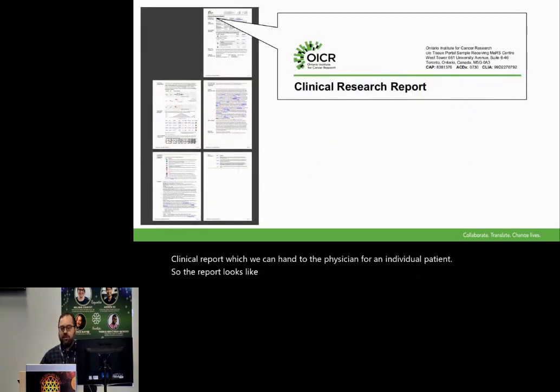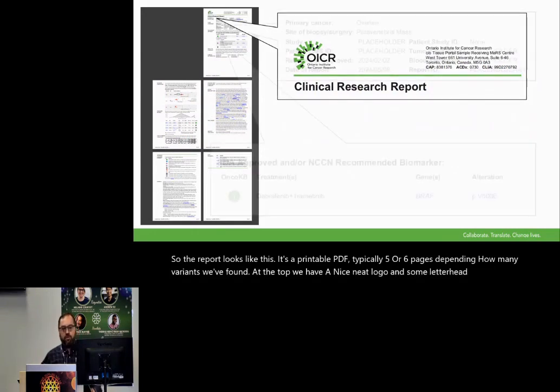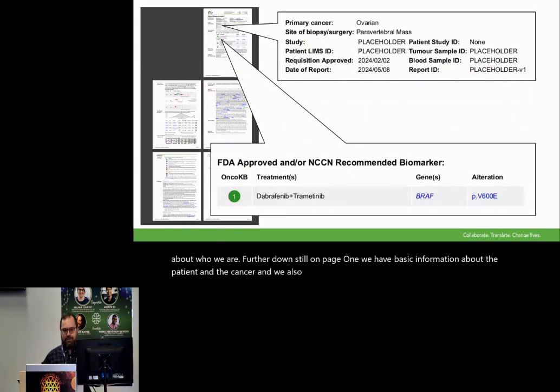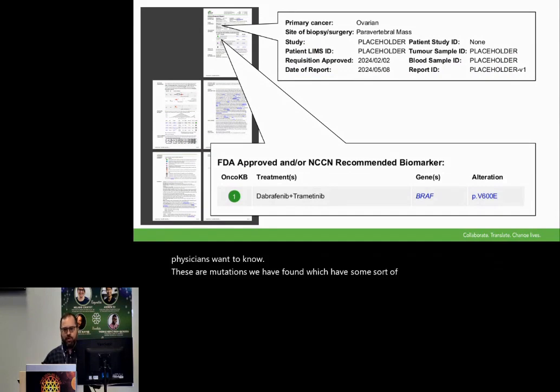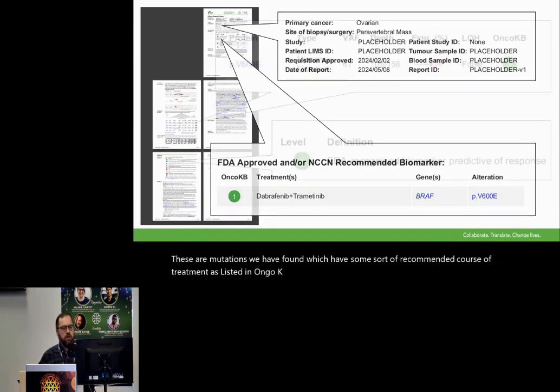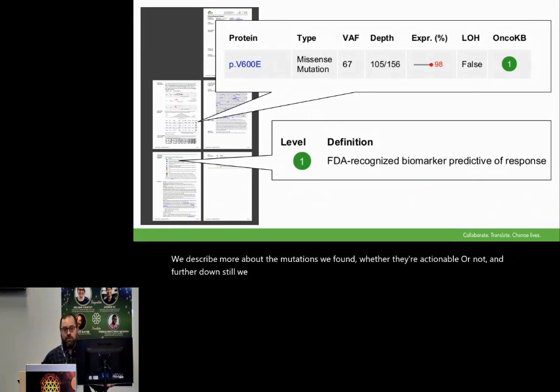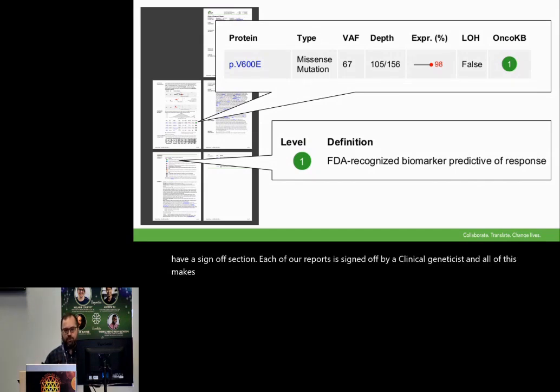The report looks like this. It's a printable PDF, typically five or six pages, depending on how many variants we found. At the top, we have a nice neat logo and some letterhead information about who we are. Further down, still on page one, we have basic information about the patient and the cancer. We also have actionable mutations — this is the number one thing physicians want to know. These are mutations we have found which have some sort of recommended course of treatment, as listed in OncoKB. Further down, we describe more about the mutations we found, whether they're actionable or not. And further down still, we have glossaries, software versions, disclaimers, and a sign-off section. Each of our reports is signed off by a clinical geneticist. All of this makes one self-contained document which can go out into the clinic.